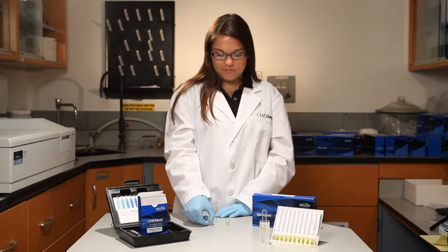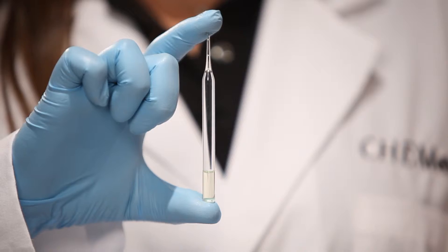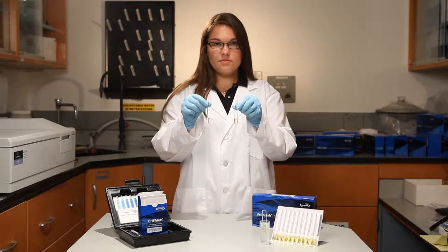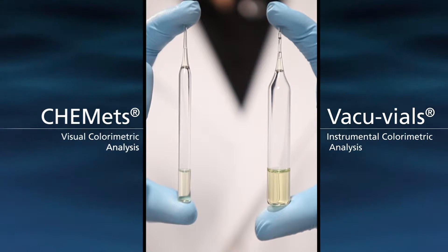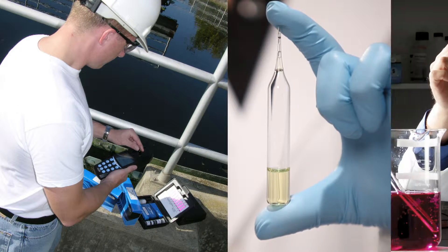Larger in size than the Visual Kemetz Ampules, Vacuvial Ampules are ideally suited for customers preferring an instrumental result when analyzing samples, whether in the field or in the lab.